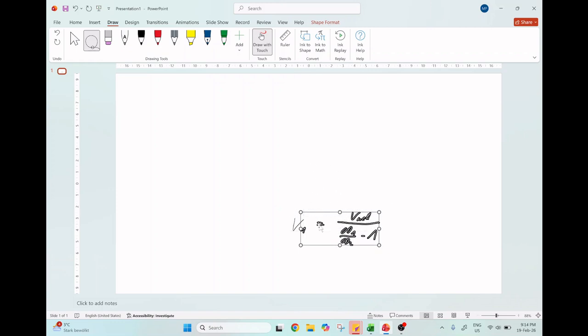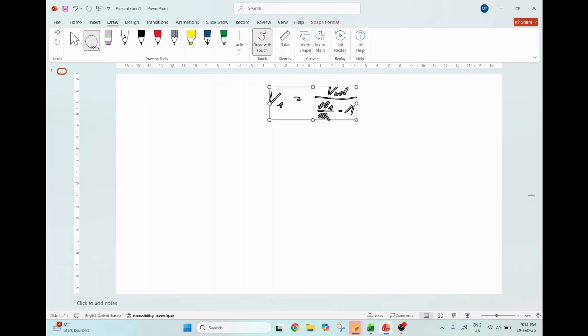Yeah, of course I didn't grab everything. Okay, let's try to make an estimate of how we select this one here, our V medium, smartly. And we can say, well, what about the situation where our OD1 is just really, really high?